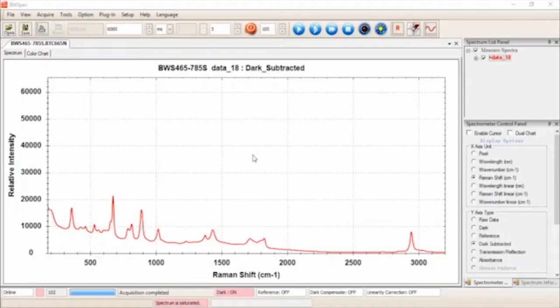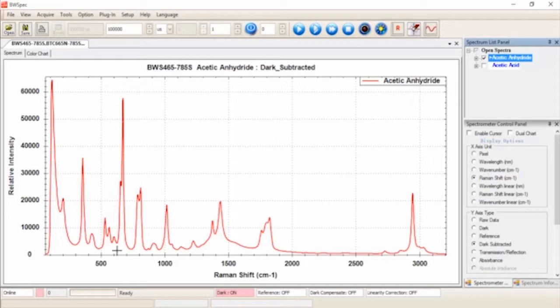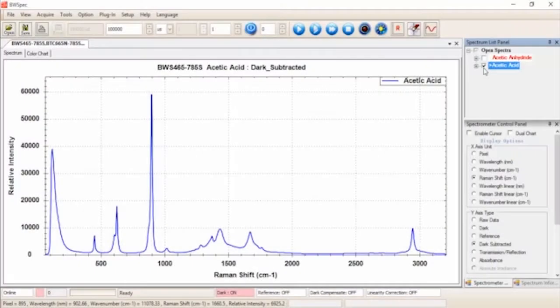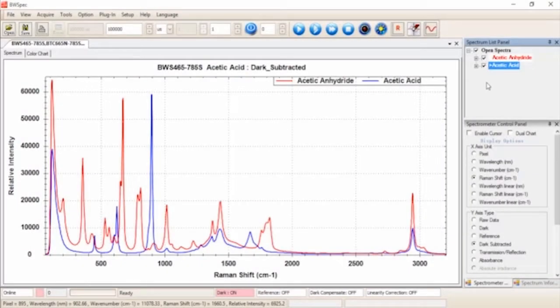Raman technology can be used to monitor the change of the Raman bands of acetic anhydride as it is consumed, while simultaneously observing the growth of the Raman bands associated with acetic acid during the reaction. The Raman spectra of pure acetic anhydride shows notable bands between 200 and 2000 wavenumbers, while pure acetic acid shows bands between 400 and 2000 wavenumbers. After conducting the reaction, there is a clear spectral shift from acetic anhydride to acetic acid — the anhydride bands between 1700 and 1900 wavenumbers have completely diminished, while the strong 898 wavenumber peak from acetic acid has formed.